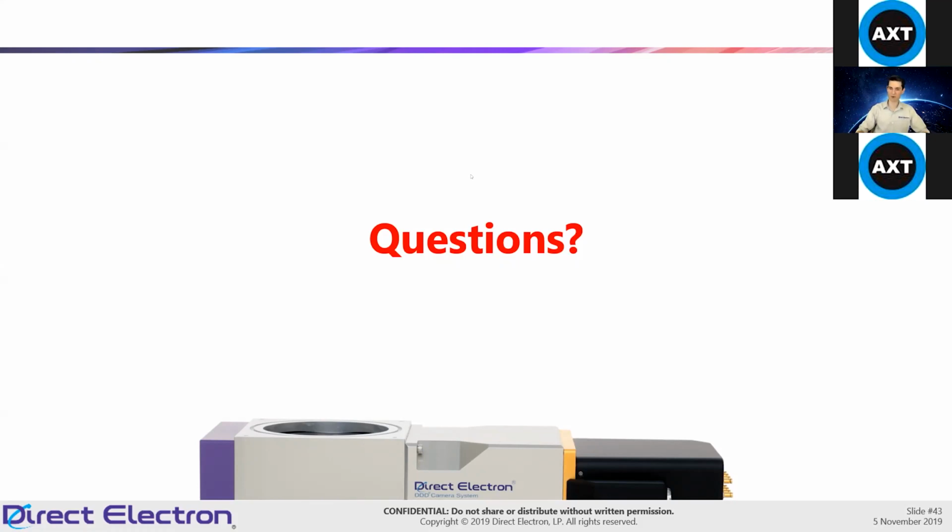So I guess the next part of this talk will mostly focus on some of the other applications that have been going on, including tomography and microED. Again, some of these things are fairly new that we're working on, and if anyone has any questions, just interrupt me or just ask the question, and I'm happy to stop and answer it.